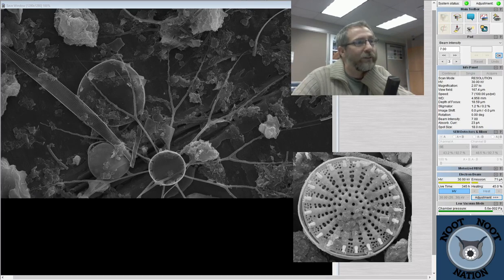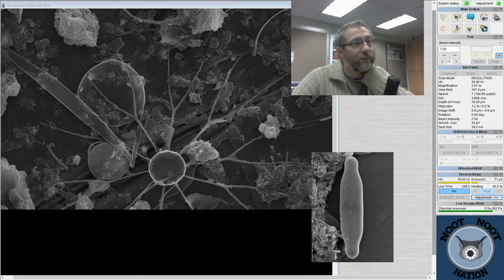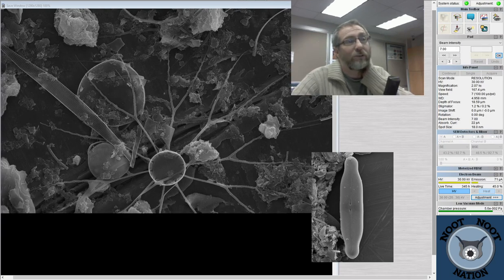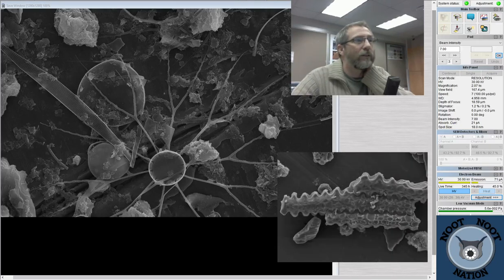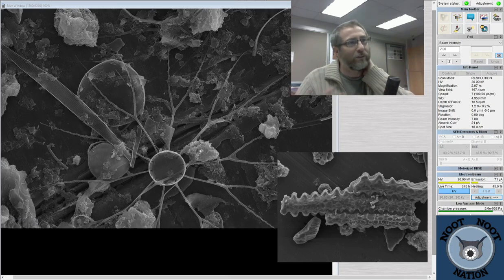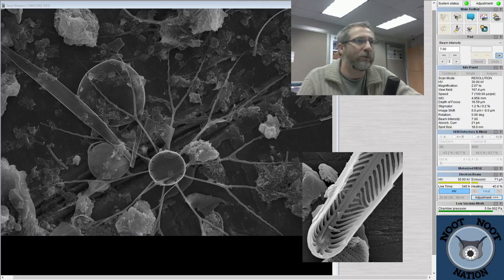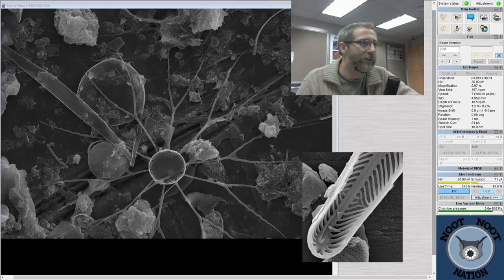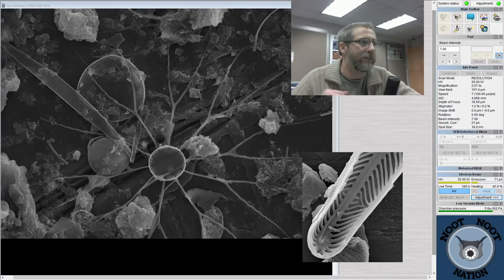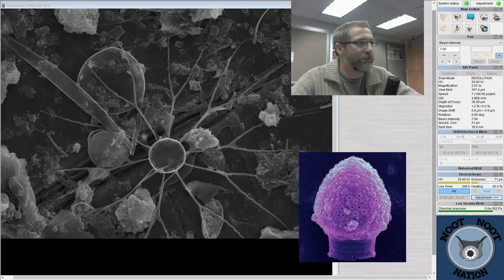A lot of the diatoms that you're seeing here are in the marine realm, and they're controlled a lot by nutrients, light, and salinity. So the ones here are pretty common in San Francisco Bay, but seasonally you might get different species based on upwelling events or temperature or pH or salinity changes. And I'm sure that she'll answer some of that for you in her streams.